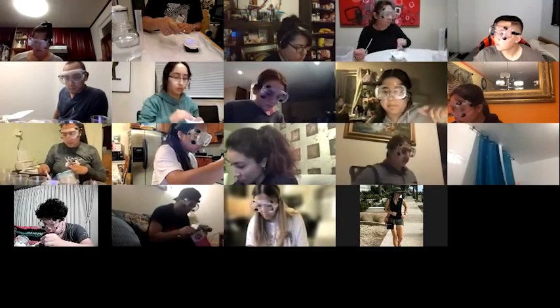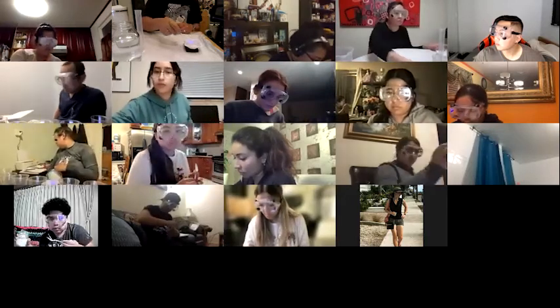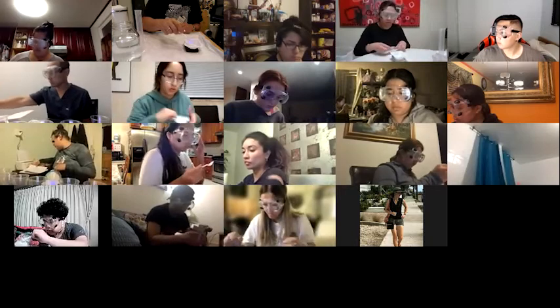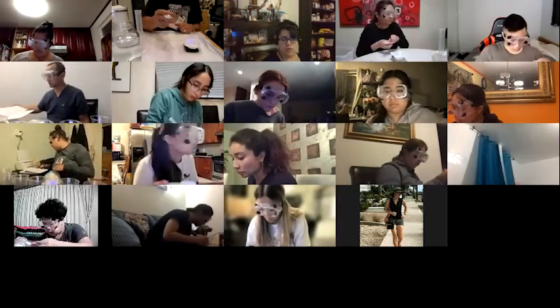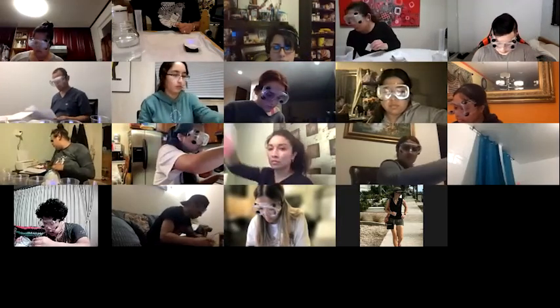Now I'm making the 20%, so I want 12.5 grams. So I'm probably going to use more than 1 scoop. Yeah, 1 heaping teaspoon is around 6 grams. So now I'm going back for some more.